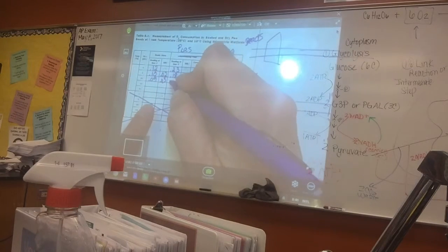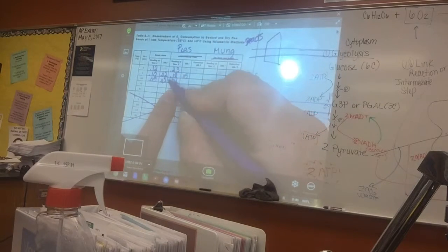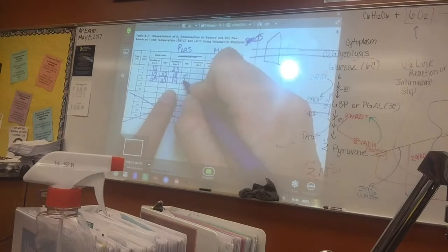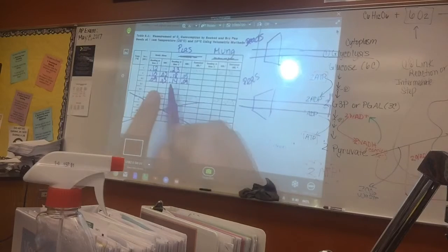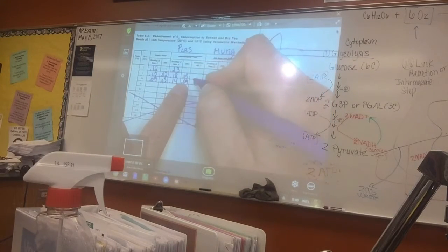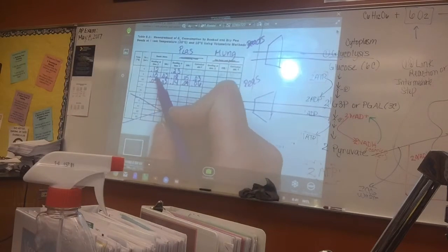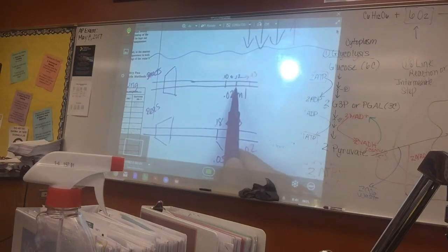Let's say my peas took in, and now it's at 0.14. So I go back to my initial 0.23 minus 0.14, which is 0.09. Then my corrected difference would be 0.09 minus the 0.03, so I have 0.06 here. And this one would be, I'll just write this down, 0.03. Is that following? Did anybody else have the beads go out like that?